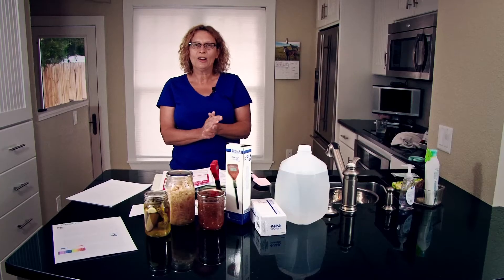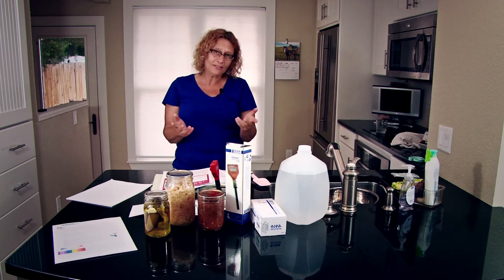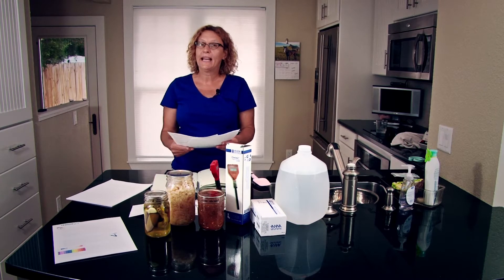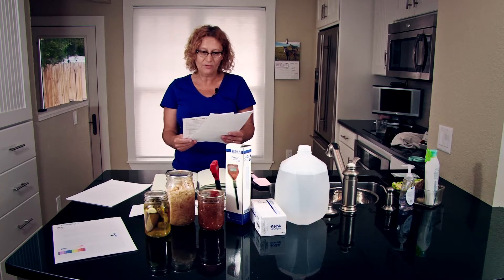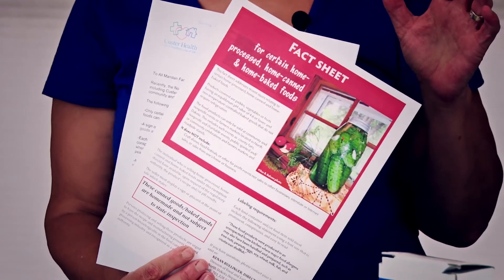Today we are going to be showing you how to check the pH of your home canned goods. You might be asking yourself, why would I have to do this? If you're a farmer market vendor or anyone who direct markets your canned goods at local fairs and non-profit events, you've probably received a letter and/or a fact sheet from the North Dakota Department of Health. This fact sheet is guidance for anyone who sells home canned goods at farmers markets.